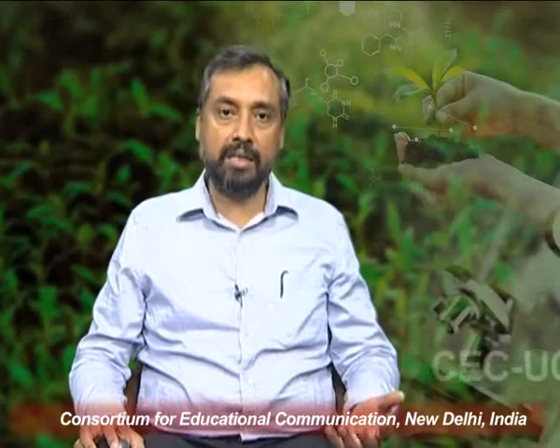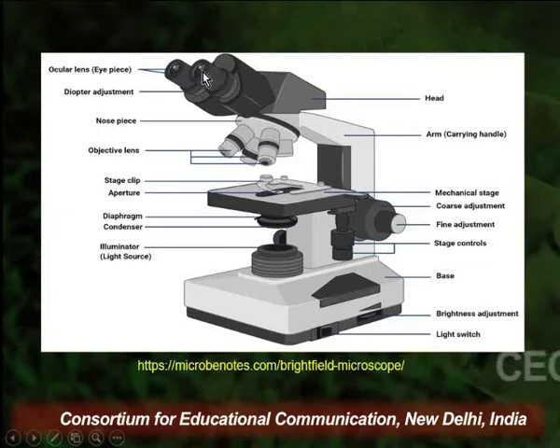And the last component happens to be the eyepiece. It works in combination with the objective lens to further magnify the image and allows it to be detected by eye, or usually to project the image into a digital camera for recording purposes. Eyepieces usually magnify by 10x, since an eyepiece of higher magnification merely enlarges the image without any improvement in resolution. So there is an upper limit to the useful magnification of the collection of lenses in a microscope. Here in the picture you can see the eyepiece, which usually is of 10x magnification.